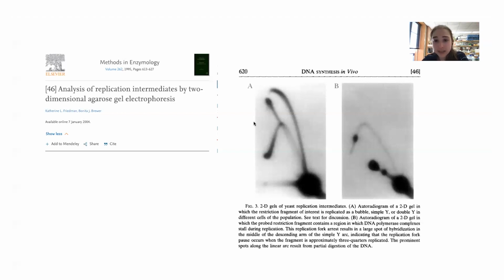And so you're probing with specific sequences. You're doing a Southern blot, and you're getting information that you couldn't get just by sequencing, because you're getting information about the actual replication state of the thing. There are other examples too, where there are different types of separation that you can do, and then probe for specific things, and you're getting more information than you get just from the sequence.